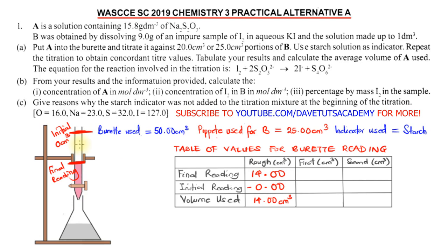We do the rough titration because water droplets may be in the burette; once we fill it with solution A, it flushes out any droplets. The rough value is often not used because it differs from the first and second readings. Since the rough titration stopped at 14.0 cm³ and the burette holds 50 cm³, we have more than enough to repeat the experiment two more times.